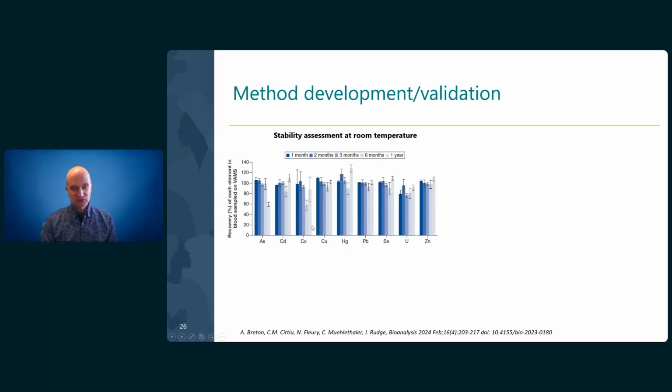And this is actually more related to the analytical aspects and not stability itself. Because for arsenic, we noticed that over time we might get, let's say, a kind of contamination. All tests were run with a blank, and that blank has been subtracted.